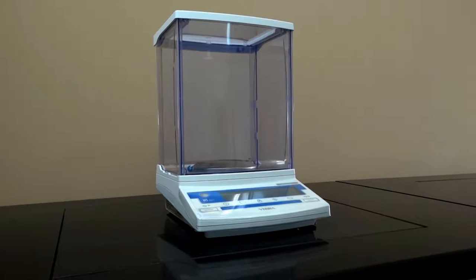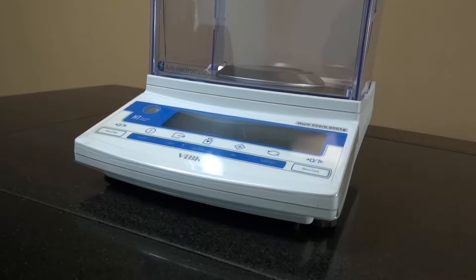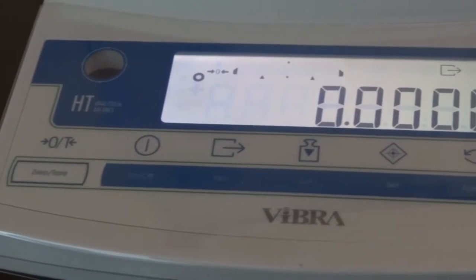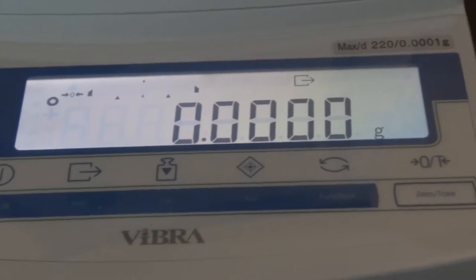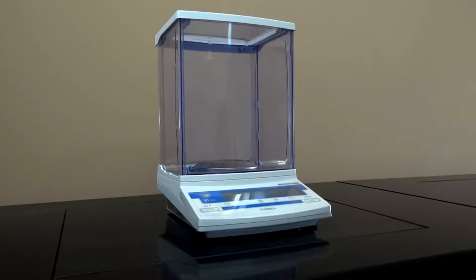The Vibra HT Analytical Balance Series is designed and manufactured in Japan, providing the sophisticated lab user with flexibility and offering many advantages.